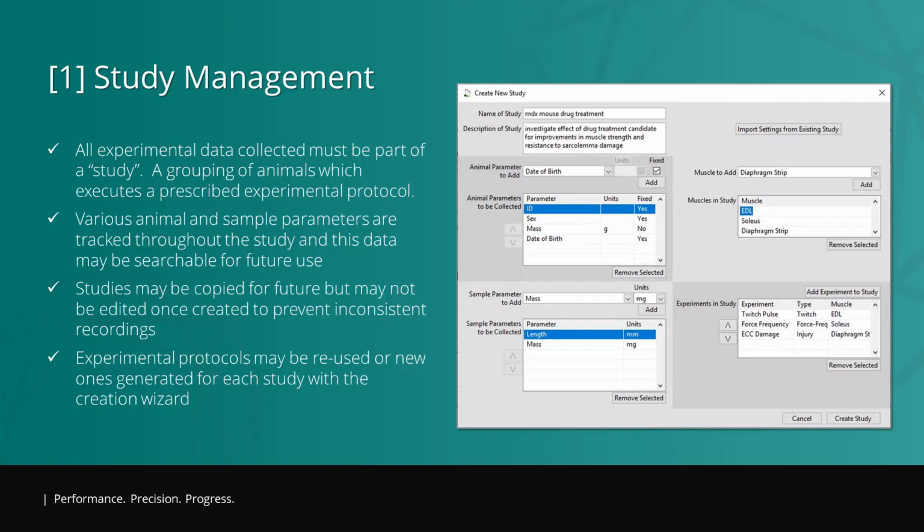This is where the name LabBook sort of originates. This idea that we would be able to track the parameters and the experimental data that is typically jotted down in a laboratory notebook. I don't know that DMC would ever replace the laboratory notebook.